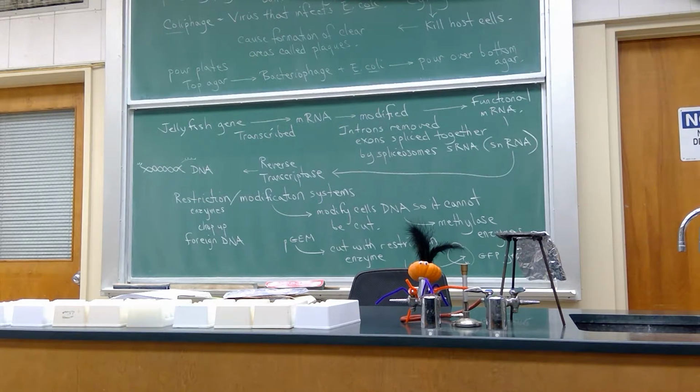Okay, so each group, and again, you're going to be working in groups like you did with the transformation exercise. Each group needs nine top agar tubes in a beaker with water.